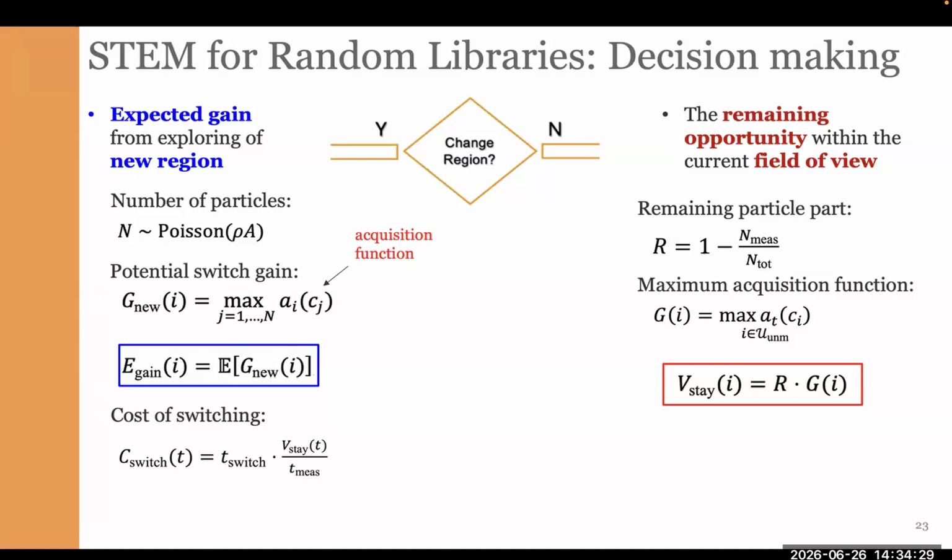And second, we consider that composition is also distributed randomly and uniformly across the particles. So we do not consider any clustering, or that you may have some inactive region, or for example some particle aggregation and other effects. So if you know nothing about the region, you have some dummy assumptions.